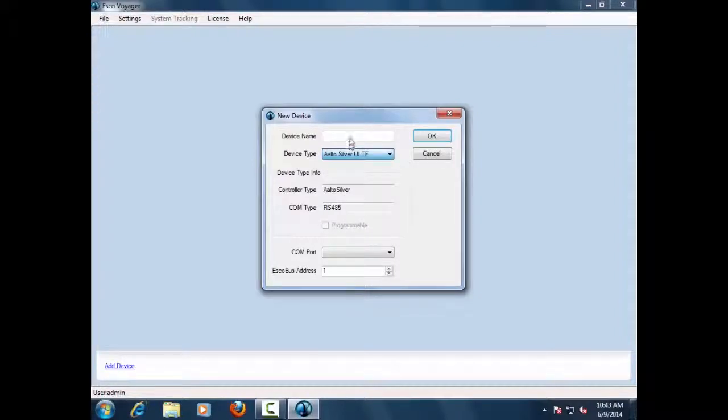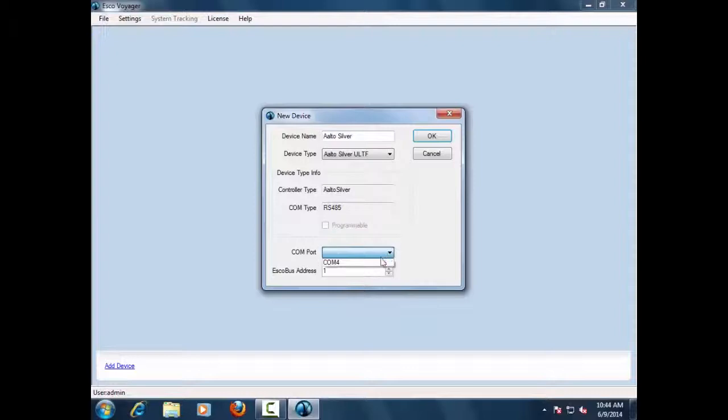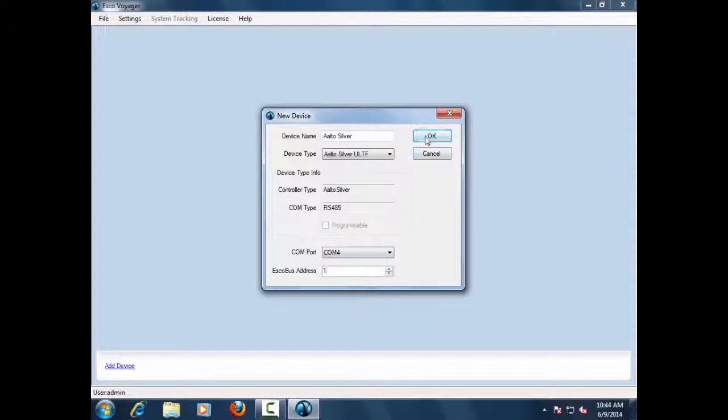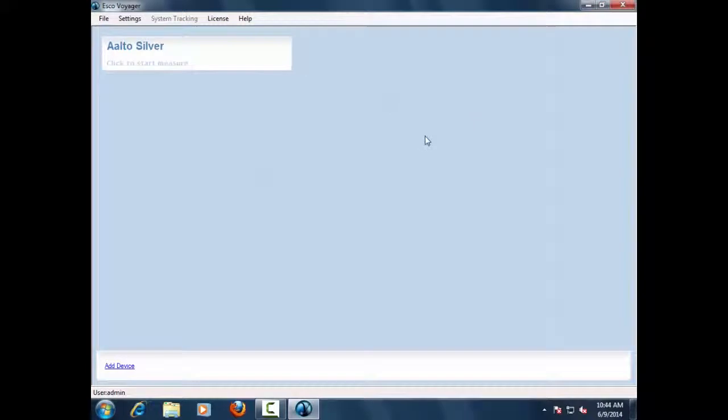For this particular selection, we use Alto Silver ULT Freezer, wherein we add in the device name, correct communication setting, and the correct ESCO bus address. For each device added, the display menu is added to the home screen.